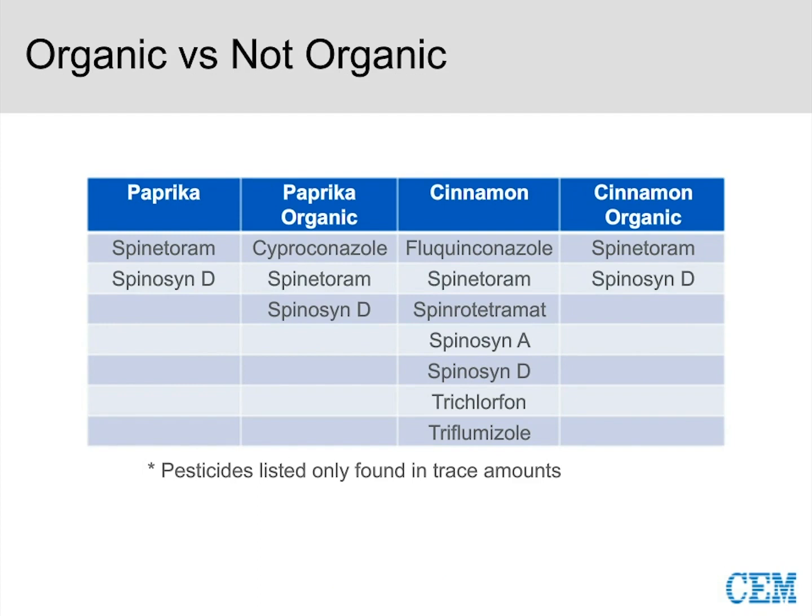With the data here, please note that I am not making any claims whatsoever regarding concentration, okay? We did not quantify this data. We're just simply saying trace amounts. I'm not making any claims of amounts in there. Just simply saying there was enough present so that we could identify it. We could accurately say this is present, but that's it. I'm only claiming presence here.